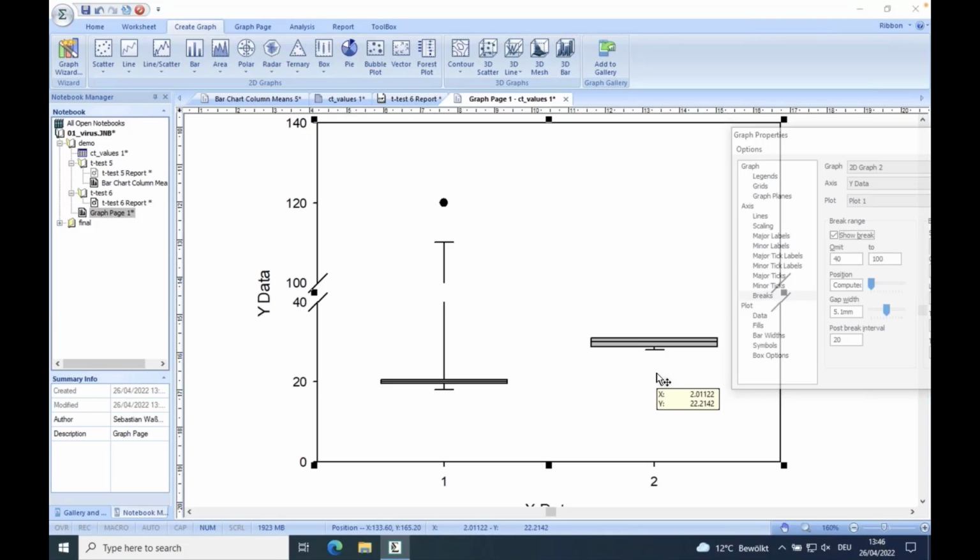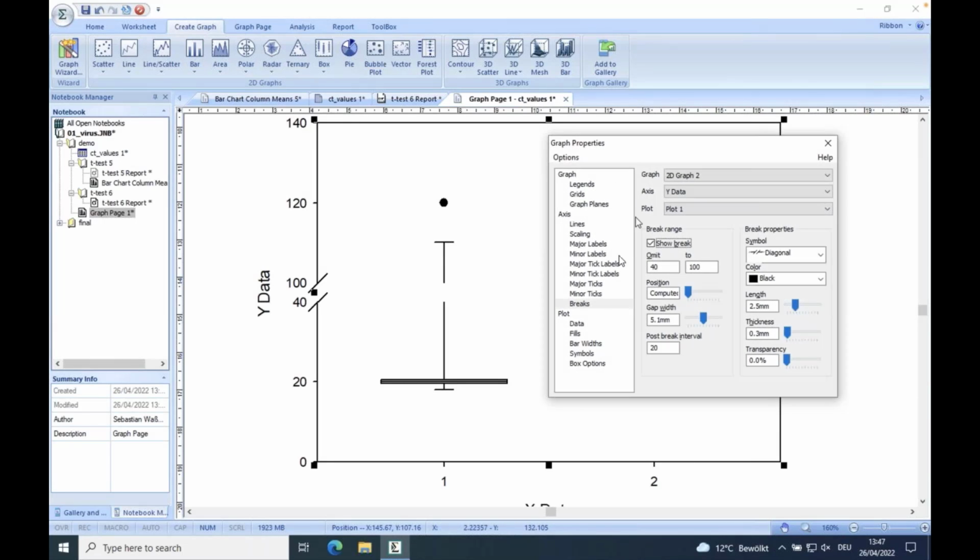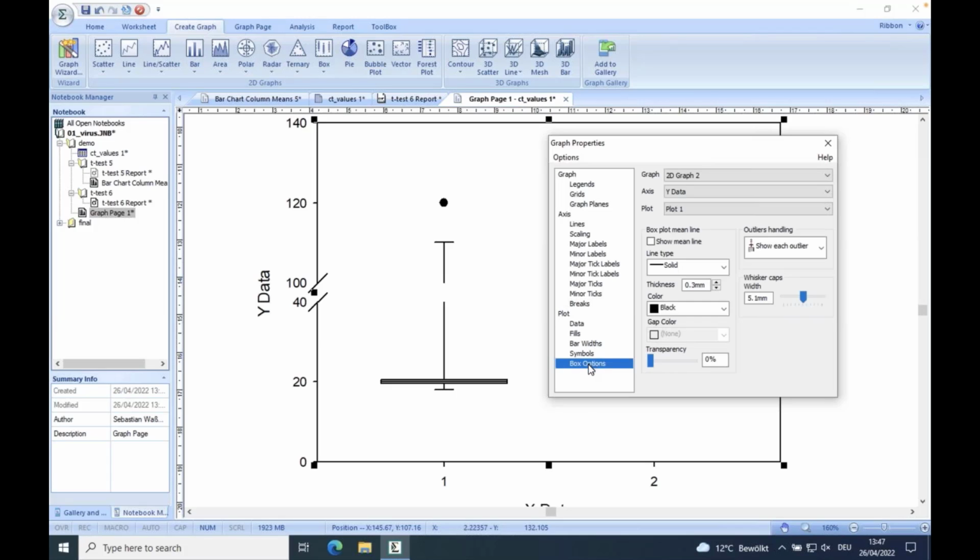even statistically significant better than drug A when we use a Mann-Whitney rank sum test, because it compares the height of the values between them, and the mean can be biased by some outliers. For example, this value here. I just plot the mean into this graph here.